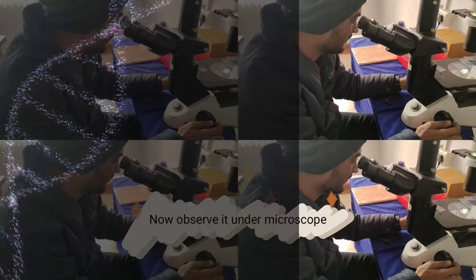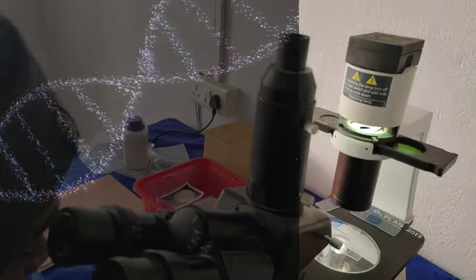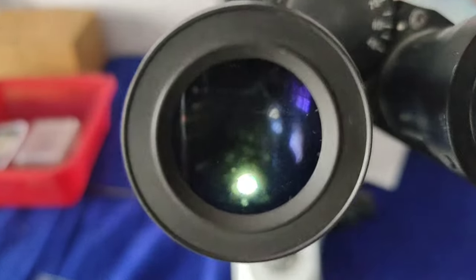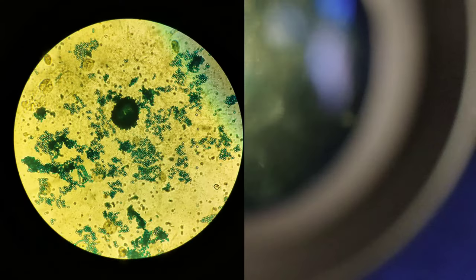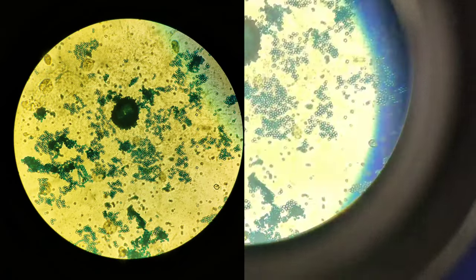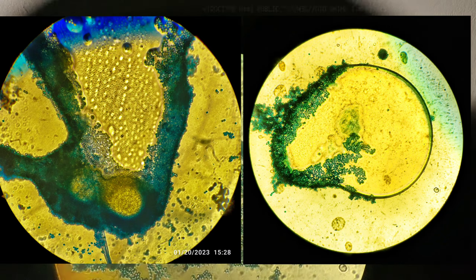You can't believe that the results are wonderful. Here are the results — here's what we see. We're going to see a little bit of staining.